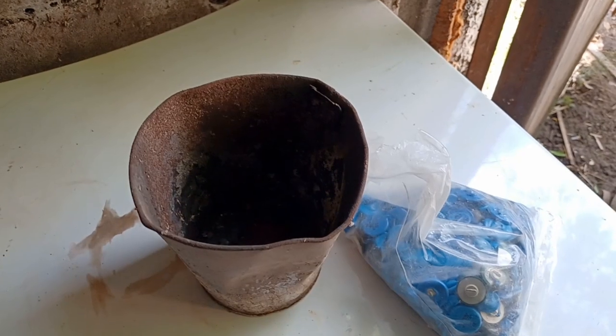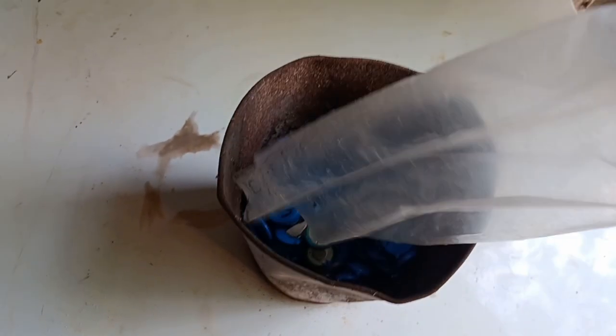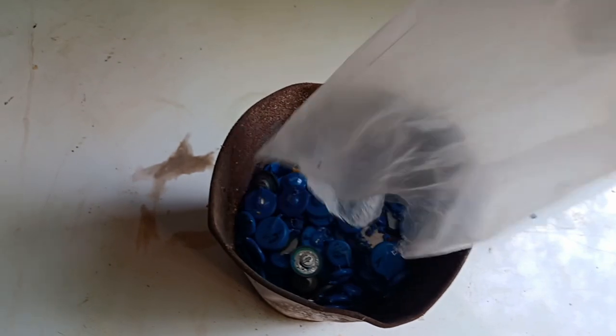First thing, I trimmed off the legs so I'm using less acid. Then I transferred the trimmed varistors into a steel bucket and burned off the epoxy.